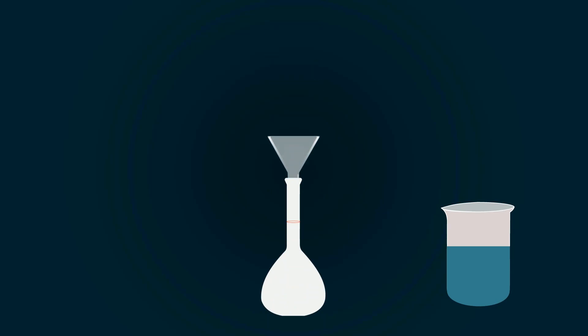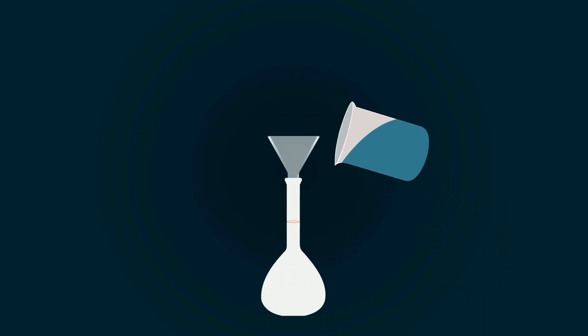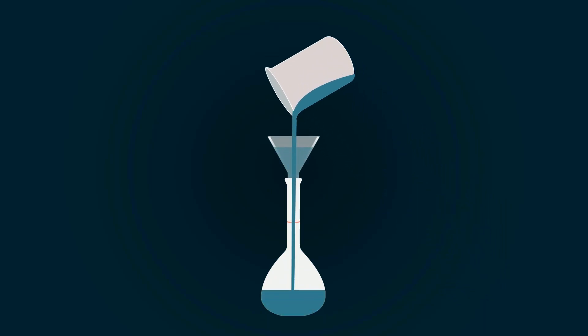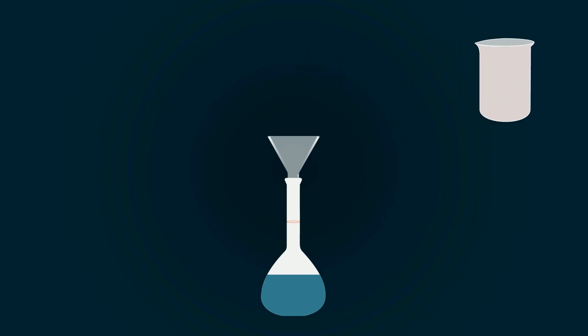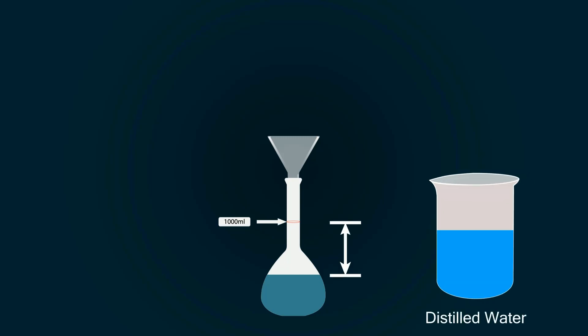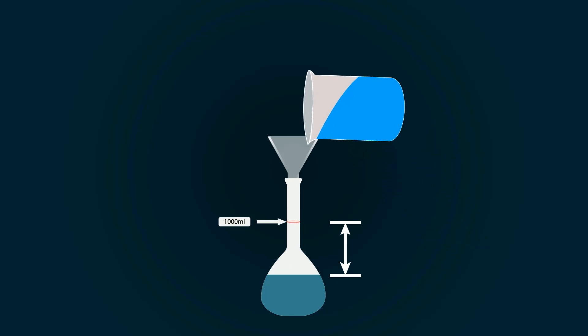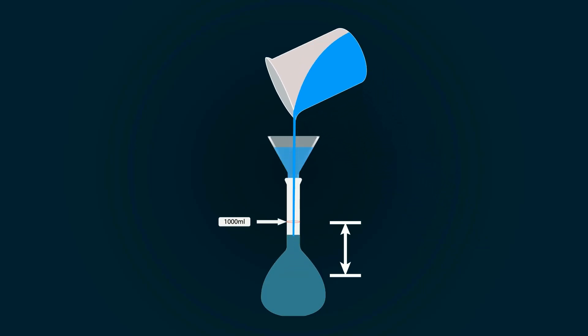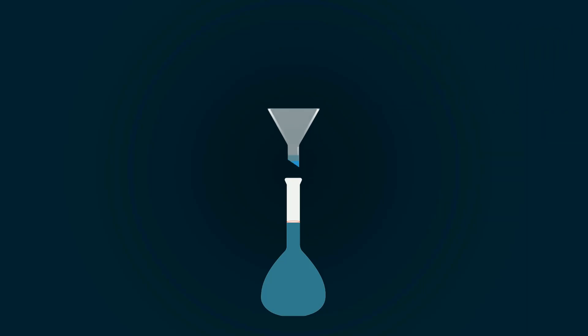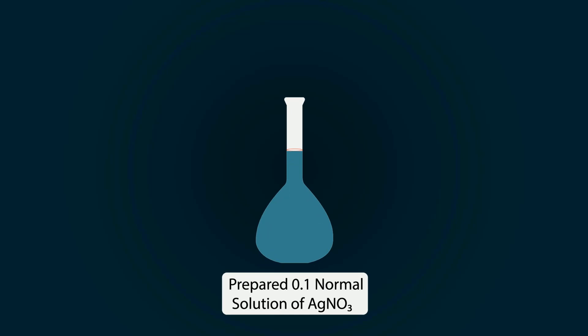Now pour the solution into the volumetric flask with the help of the funnel. You have to fill the flask up to the 1000 ml mark. For that you have to add more distilled water. Take distilled water into the empty beaker and start pouring it into the volumetric flask. Now you have successfully prepared 0.1 normal solution of silver nitrate.